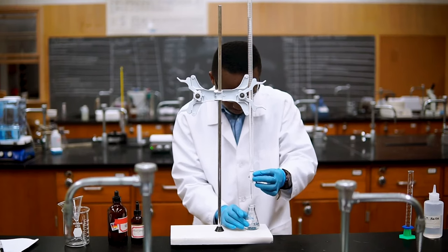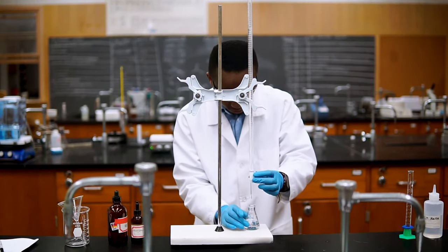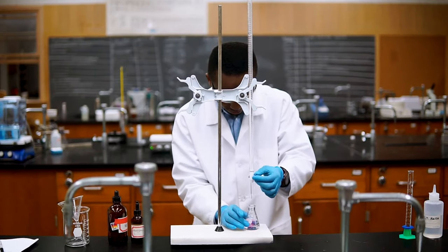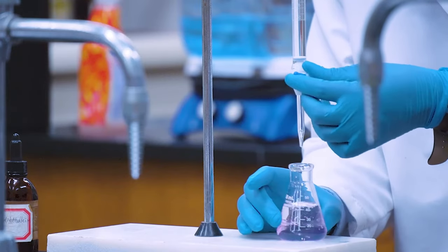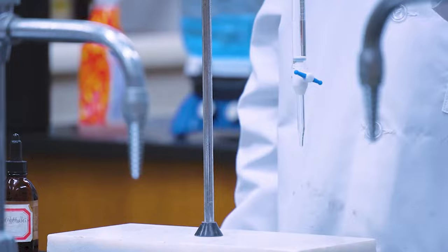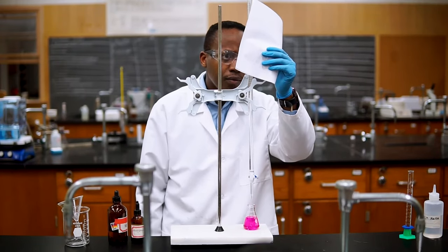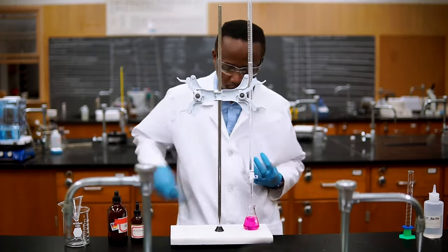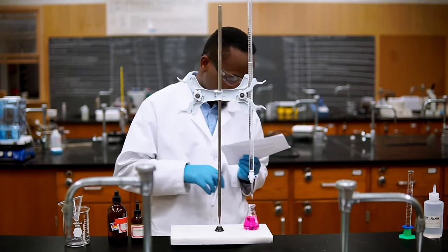To do this, let's open the burette and let the base go down quickly as you swirl the flask, which could also be stirred with a magnetic stir bar if you desire. You'll stop every now and then to check if there's a color change that's persistent. When you see this persistent change, you will know that you have reached the equivalence point. Record the end volume reading on the burette and subtract that from the initial reading to get the volume added. This volume is an estimate of how much it will take to reach the equivalence point.